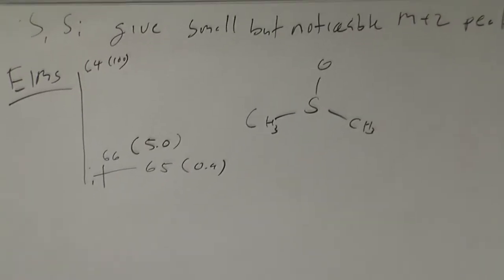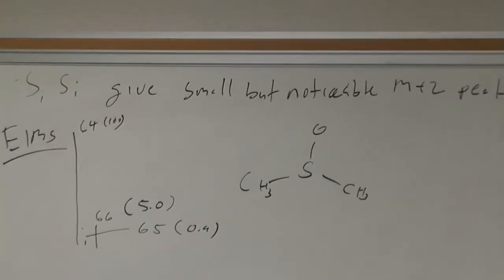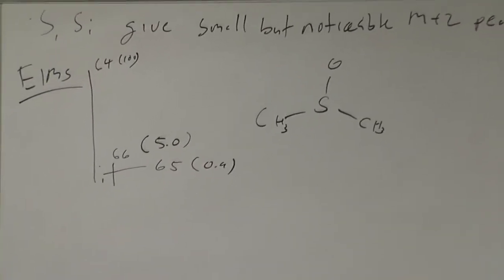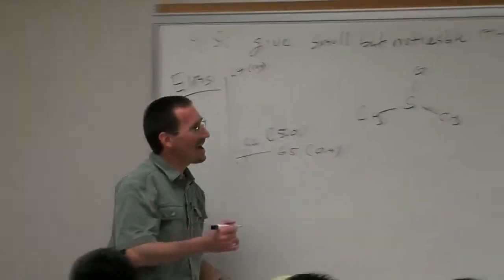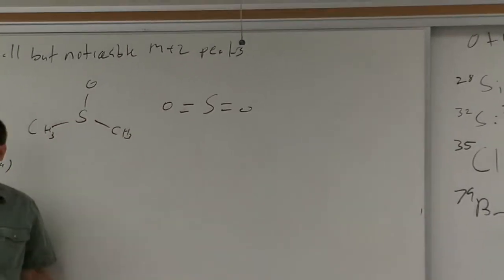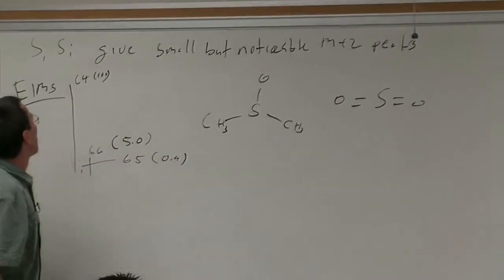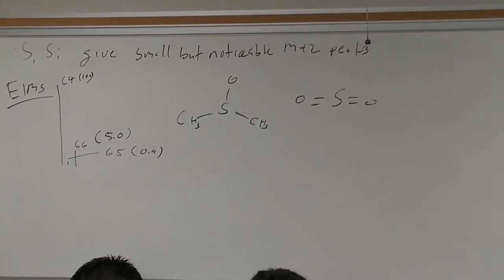It's got a sulfur or silicon in it. Sulfur dioxide. So what do people think? Mass works out, right? 32, 16, 16. So that's 64. What about the isotope pattern?